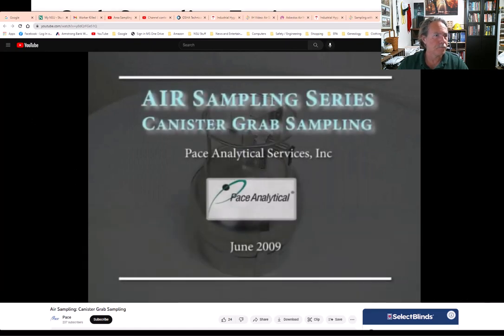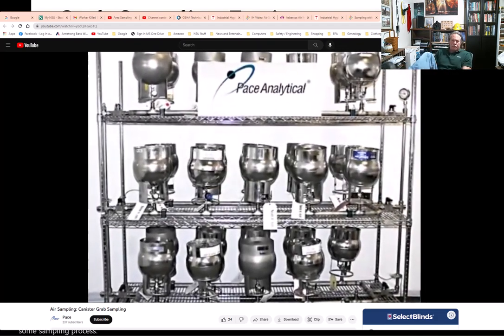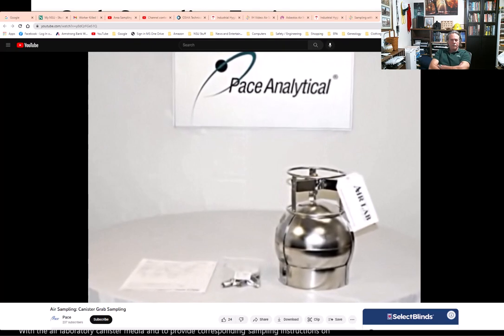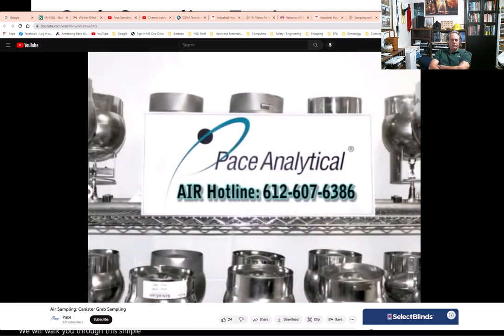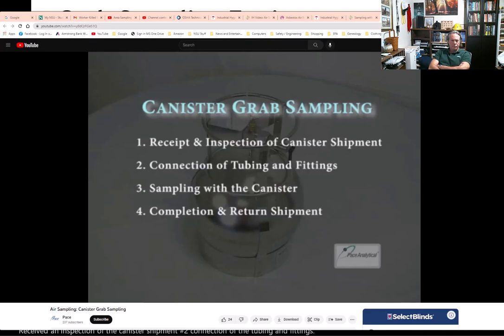Welcome to the Pace Analytical video production series for air sampling. Pace Analytical has created the following demonstration to familiarize you with the air laboratory canister media and to provide corresponding sampling instructions on how to collect a grab sample. We will cover: receipt and inspection of the canister shipment, connection of the tubing and fittings to a predetermined sampling point, sampling with the canister, and completion and return of the shipment.